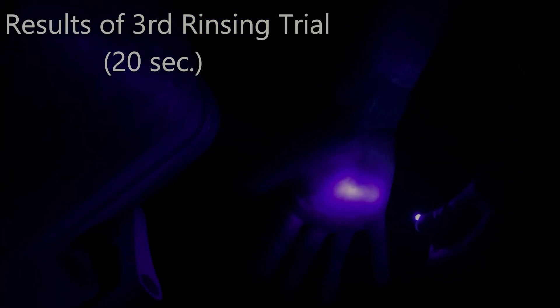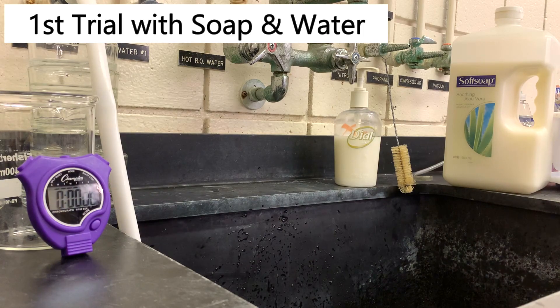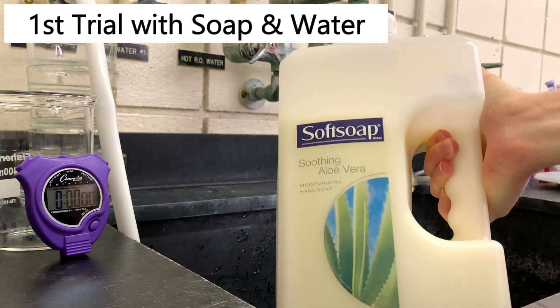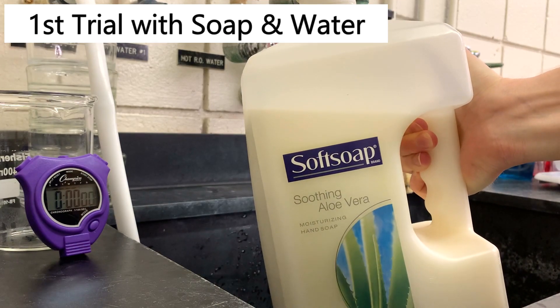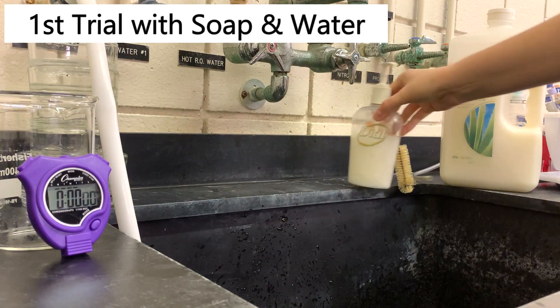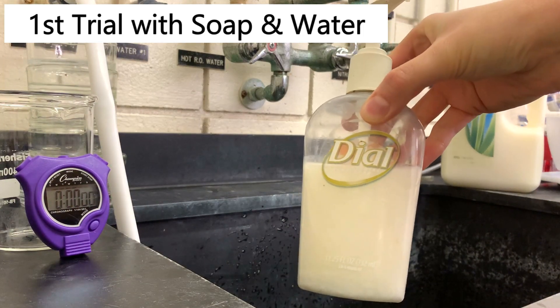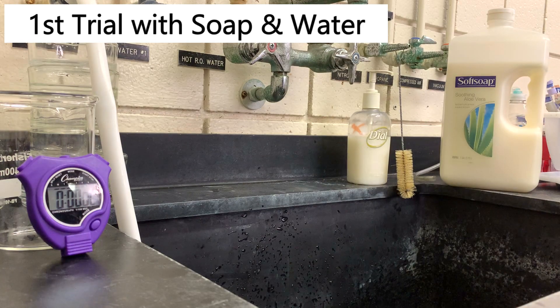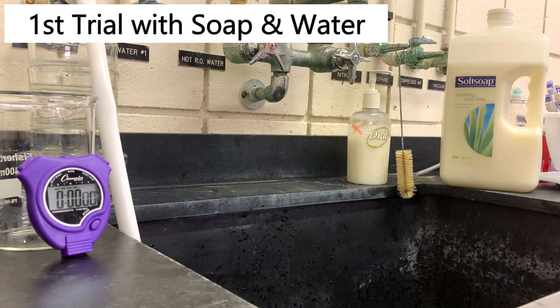Let's use some soap and scrubbing and see how that affects our results. Now we're going to start the trials using soap. For these trials we are going to be using this soft soap — it's not really anything special, it does have aloe vera in it, but that really shouldn't make a difference as far as our trial goes. We're going to be doing three times: five seconds, ten seconds, and twenty seconds. What I'm going to do is wet my hands and then scrub with soap for five seconds for the first trial, then rinse just long enough to get the soap off.